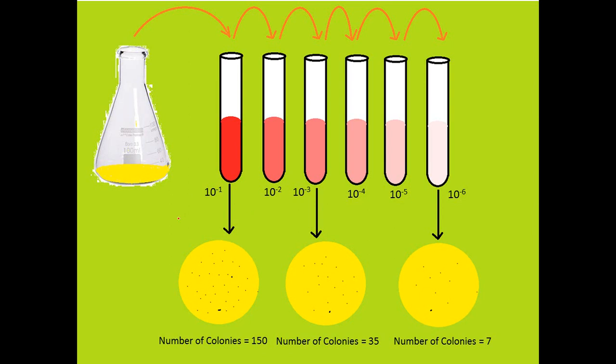So here you can follow either the pour plate technique or the spread plate technique. After you do the pour plate or the spread plate technique, you will obtain different numbers of colonies and different types of colonies.